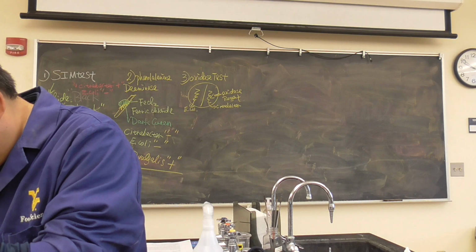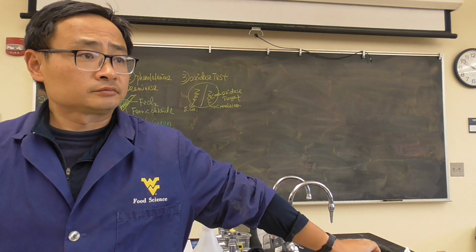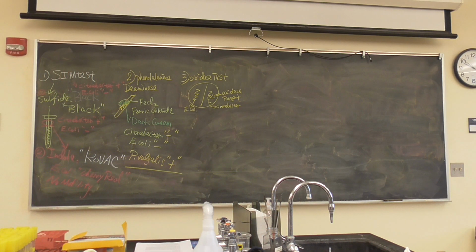Looks like it's not very purple. Slightly. Tiny, slightly. See? Slightly purple. From the Citrobacter part, slightly purple.